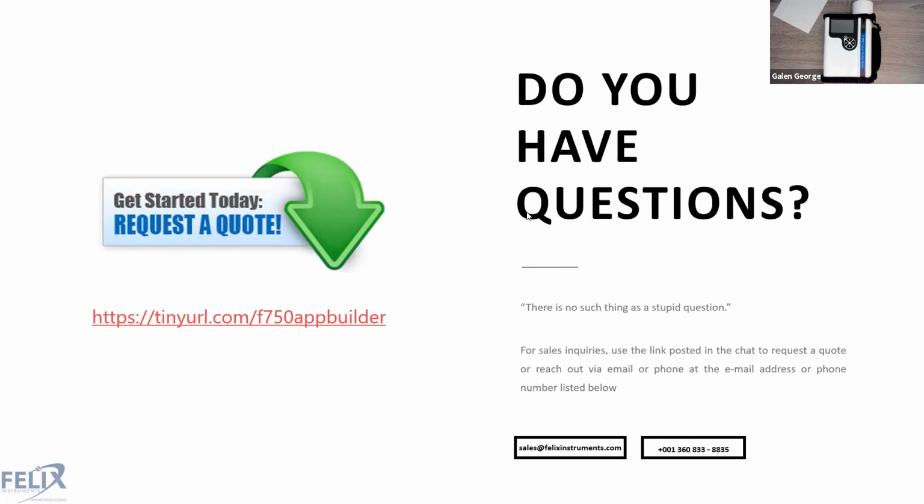Also, if you do build or create a new app from scratch currently, this blank app will have exactly what you're asking. It'll just show the prediction without the standard deviation. It'll just show the prediction of that particular scan. So that is an option as well if you want to go with that. It doesn't look as advanced as the current UI for the new apps does, but there are other options. So yeah, we can help make sure that you can access that if you want.